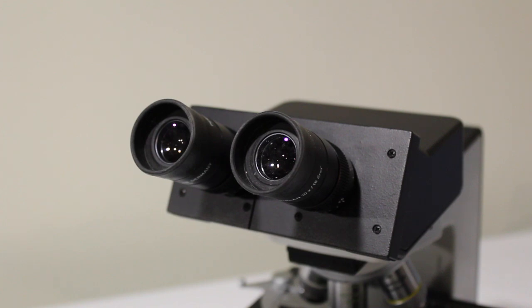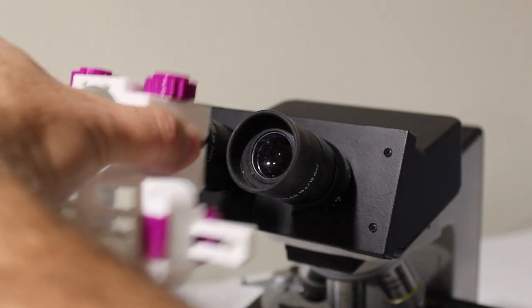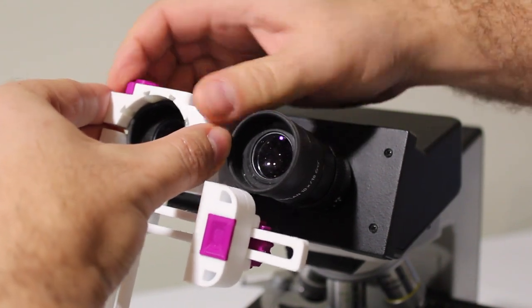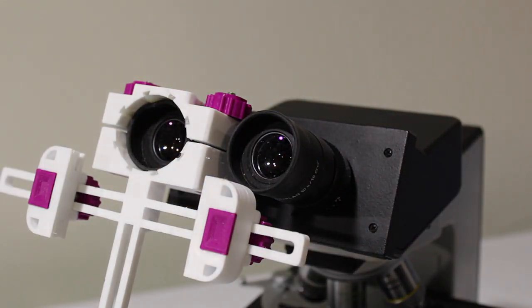This is really unnecessary for the vast majority of brewery uses. I can think of no reason why a brewer outside of a yeast lab would need a trinocular head. In fact, simple devices like these are readily available for purchase or to make, which allow you to do things like mount a cell phone onto the microscope and to use that as a camera.